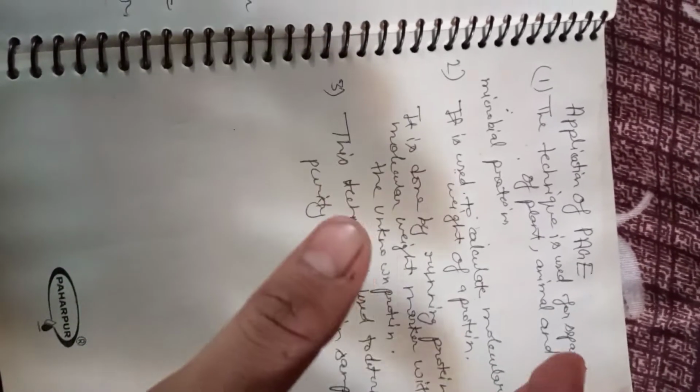The applications of PAGE, polyacrylamide gel electrophoresis: it is used for the separation of plant, animal and microbial proteins. It is used to calculate the molecular weight of a protein, which is done by running protein sample markers with the unknown protein. This technique is used to determine the purity of a protein sample. It is also used in Western blotting.